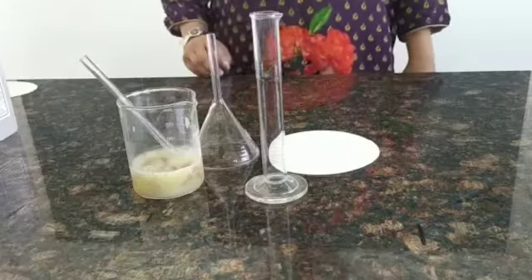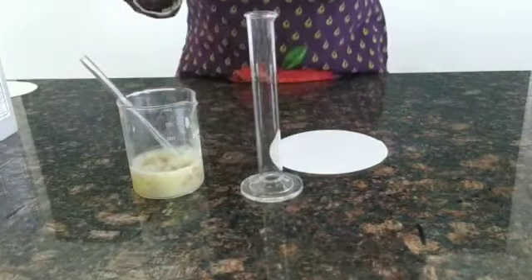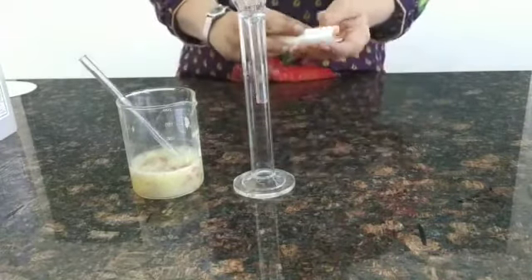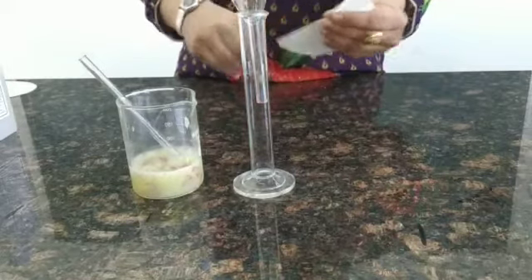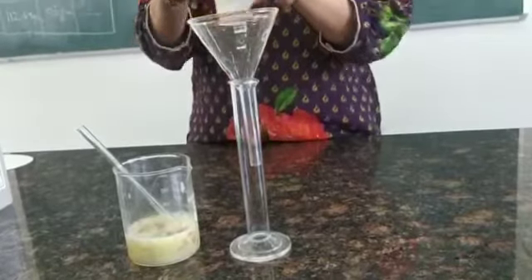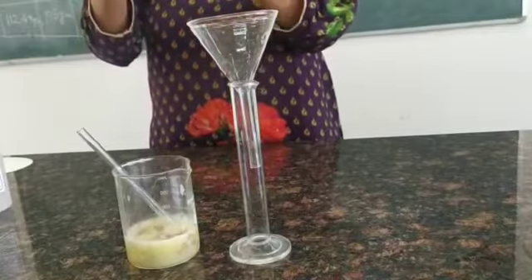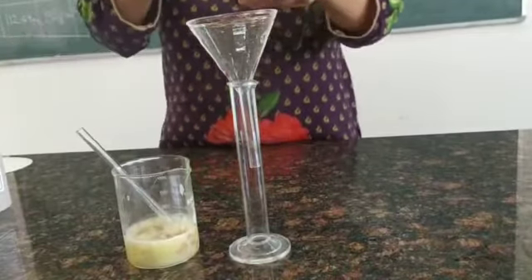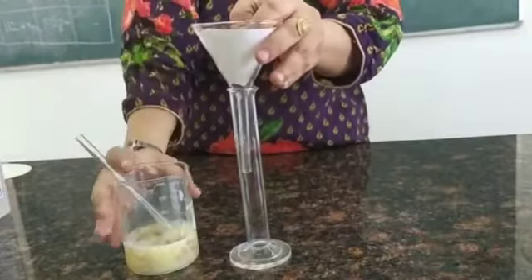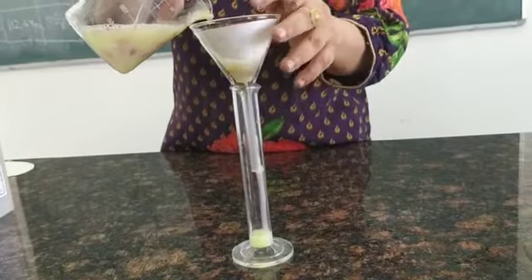The next step is filtering out the solid material. We take the glass cylinder and place the funnel into it, fold the filter paper, and place it in the funnel. Gently we pour the solution into the funnel, making sure there are no air bubbles.